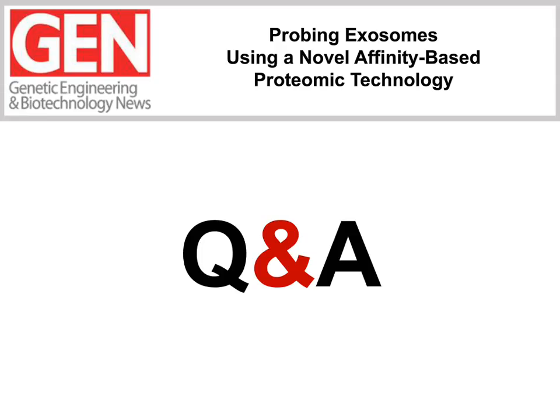So we've adopted a column chromatography-based approach now. I'm not saying that this is the best method. There may well be more effective methods that give you a purer product. We'll see what they turn out to be. But for us, in our hands, the column is fairly quick, it's not too cumbersome, and the product it gives us does get rid of an awful lot of those highly abundant plasma proteins that confound and will completely interfere with a mass spec-based readout.